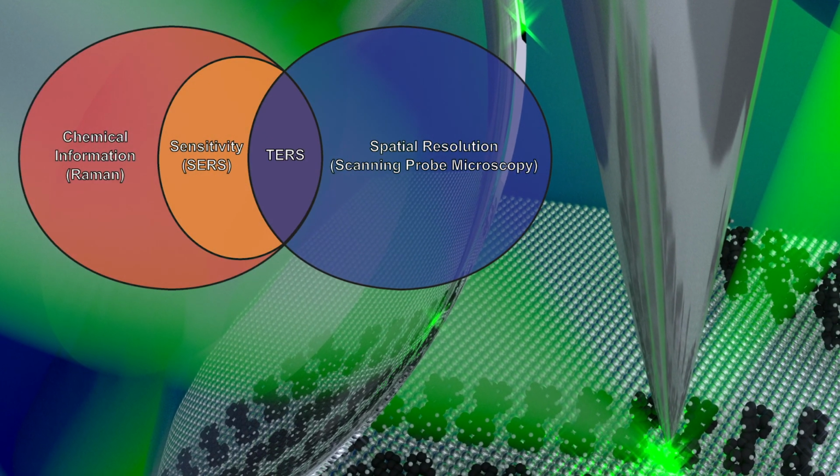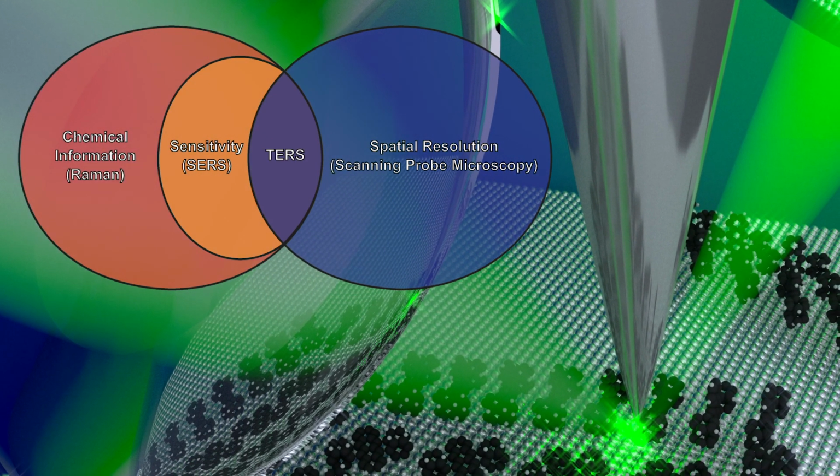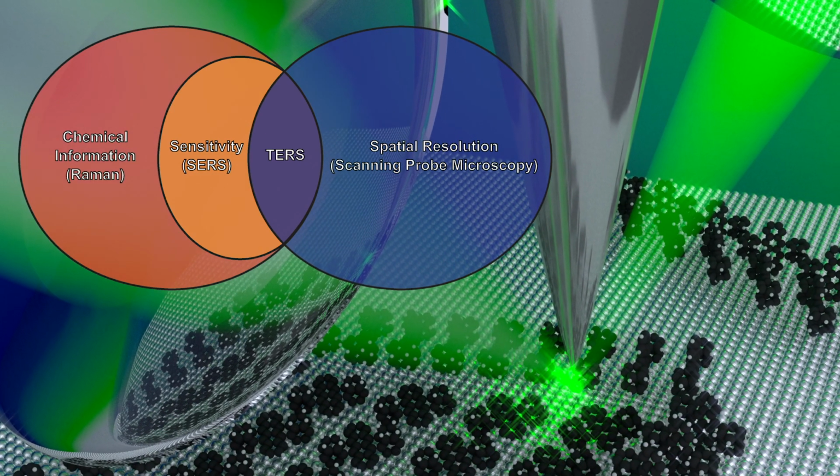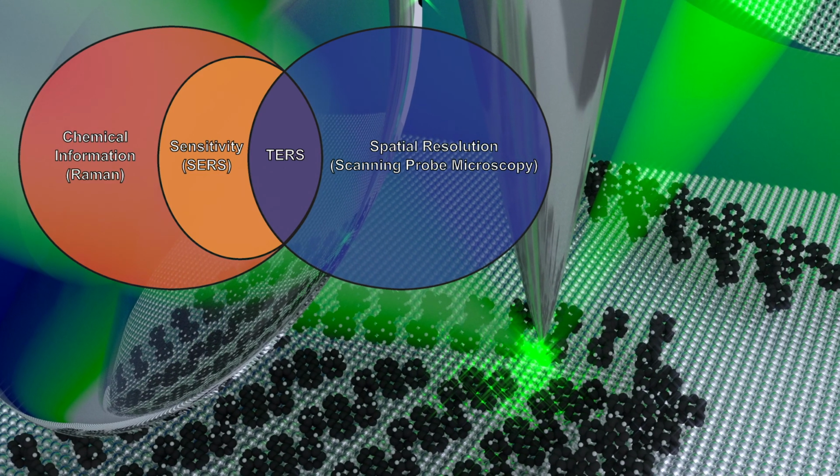To conclude, as a truly tandem technique, UHV STM TERS occupies a unique position among surface characterization methods. Simultaneous STM and TERS imaging provide real space localization of detailed vibrational fingerprints at the Angstrom scale, enabling the study of the effects of highly localized chemical environments on molecules, materials, and reactions.